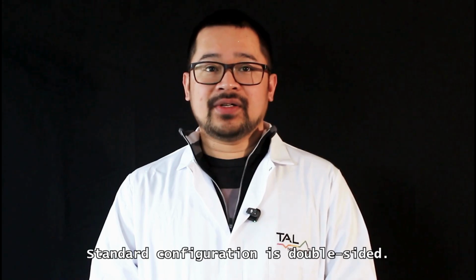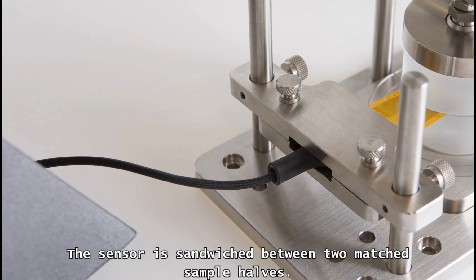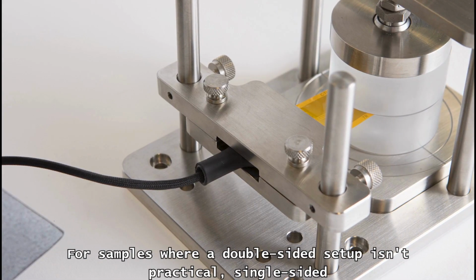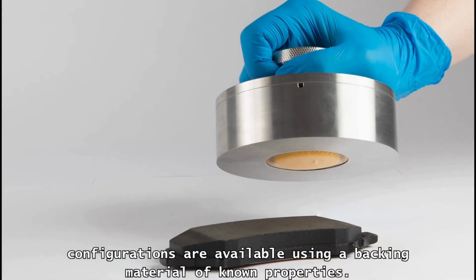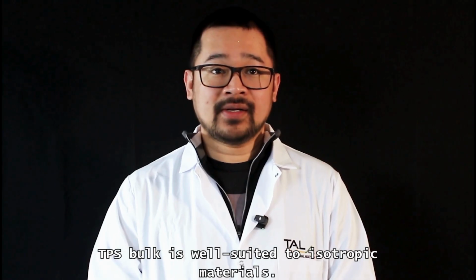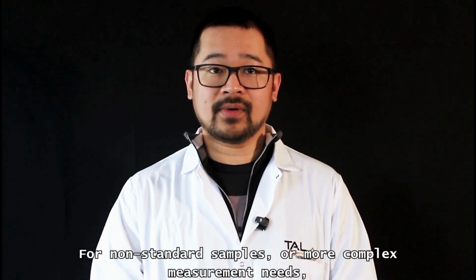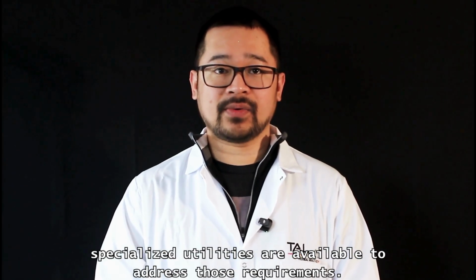The standard configuration is double-sided. The sensor is sandwiched between two matched sample halves. This symmetrical setup gives the cleanest signal. For samples where a double-sided setup isn't practical, single-sided configurations are available using a backing material of known properties. TPS bulk is well suited to isotropic materials. For non-standard samples or more complex measurement needs, specialized utilities are available to address those requirements.